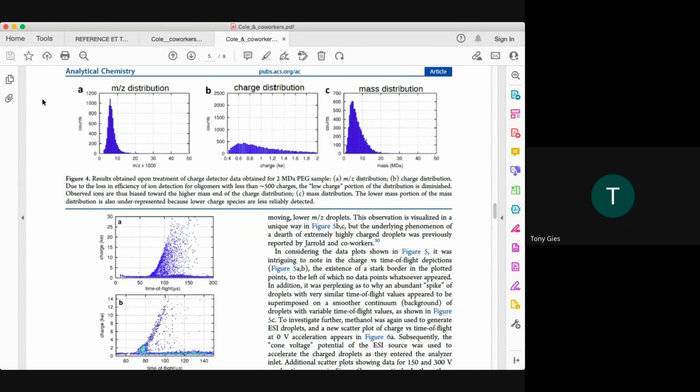Okay, the reason why I ask is because this seems like just an amazing application. Have you ever thought of looking at quantum dots? Because now this could be something ideal if you wanted to get into the electronics materials industry for helping ensure the reproducibility of batch to batch. Even if you don't have the exact molecular weight, if you could show, oh, this is reproducible, this one's out, I think this could be a huge improvement for them.